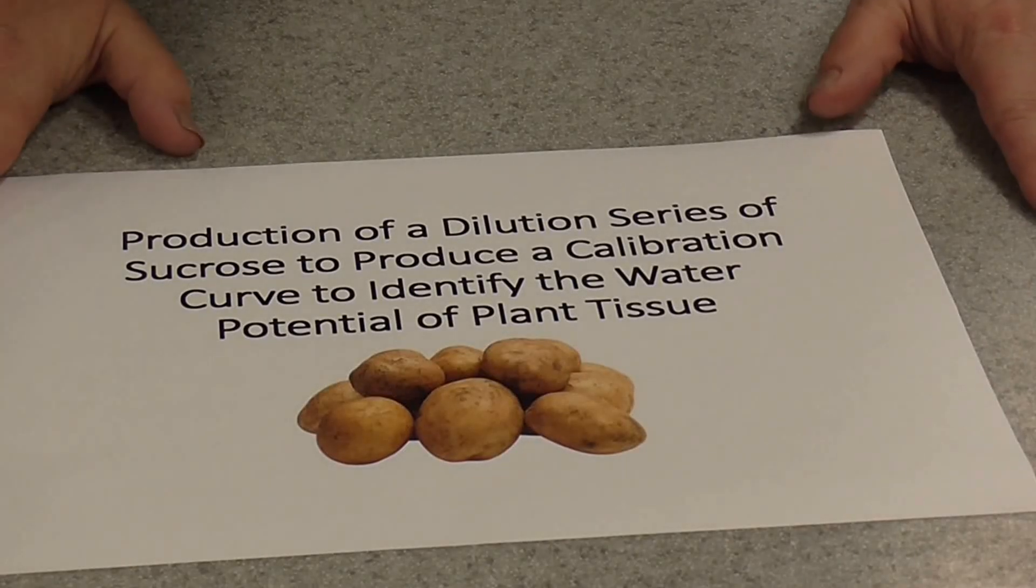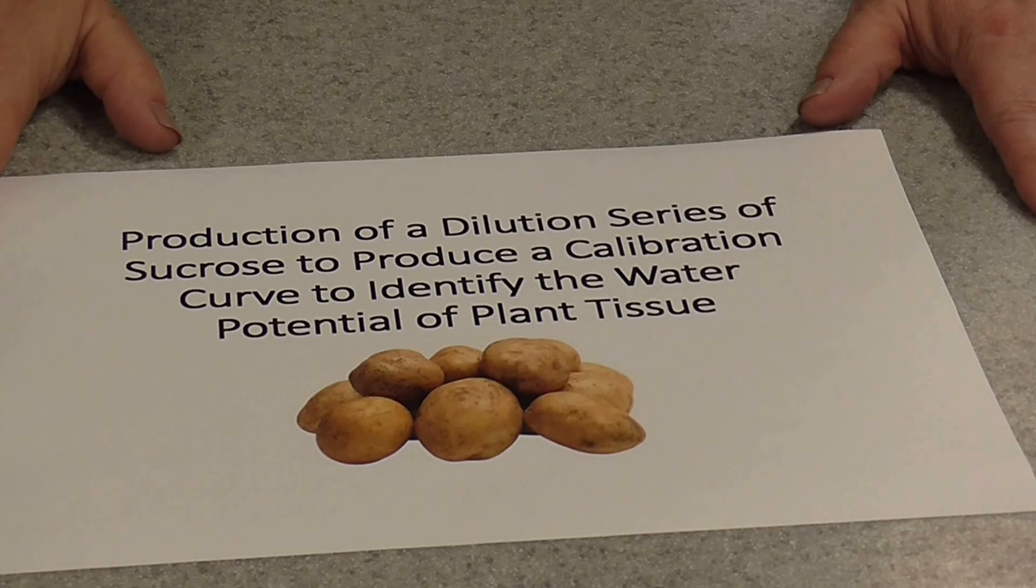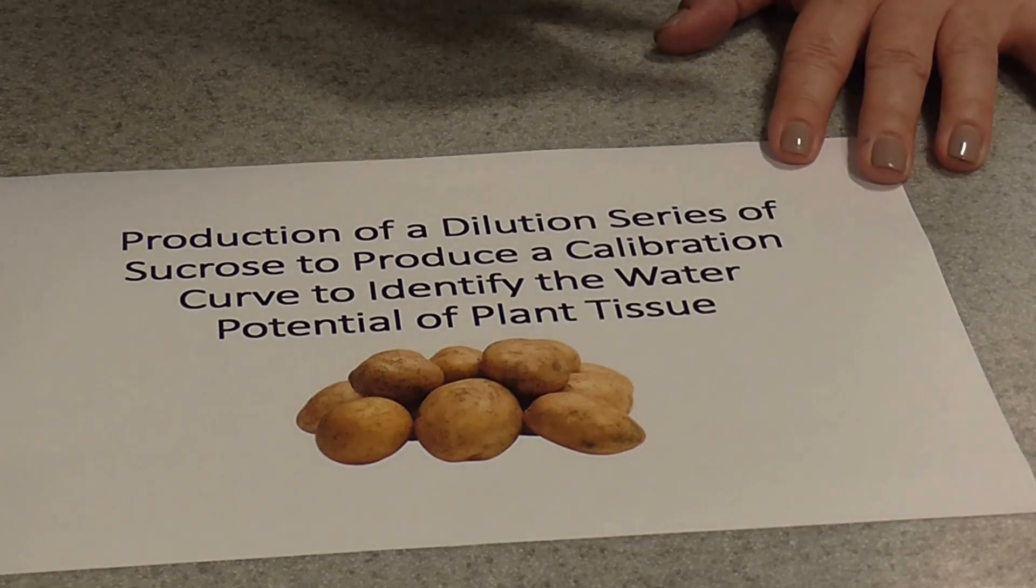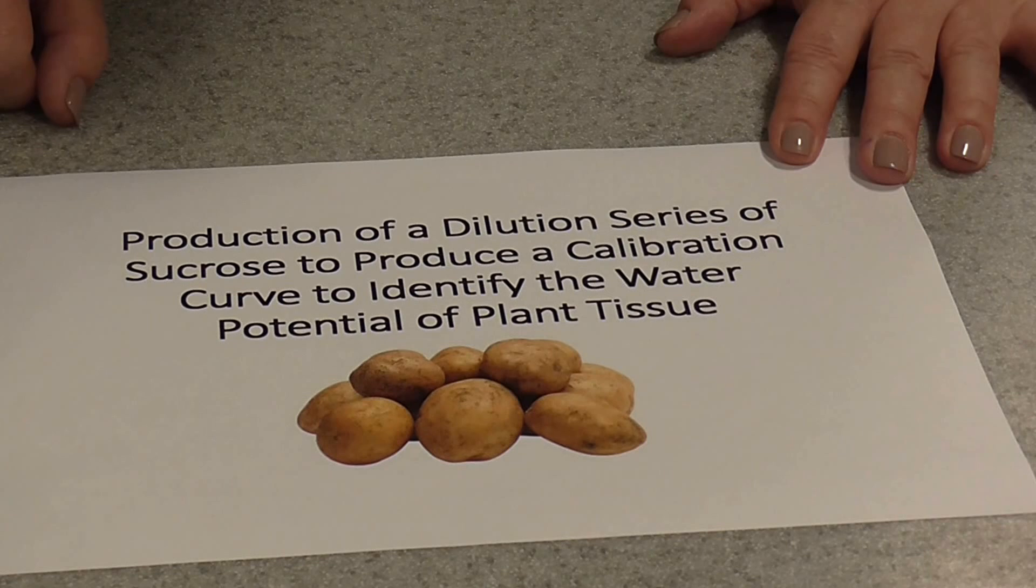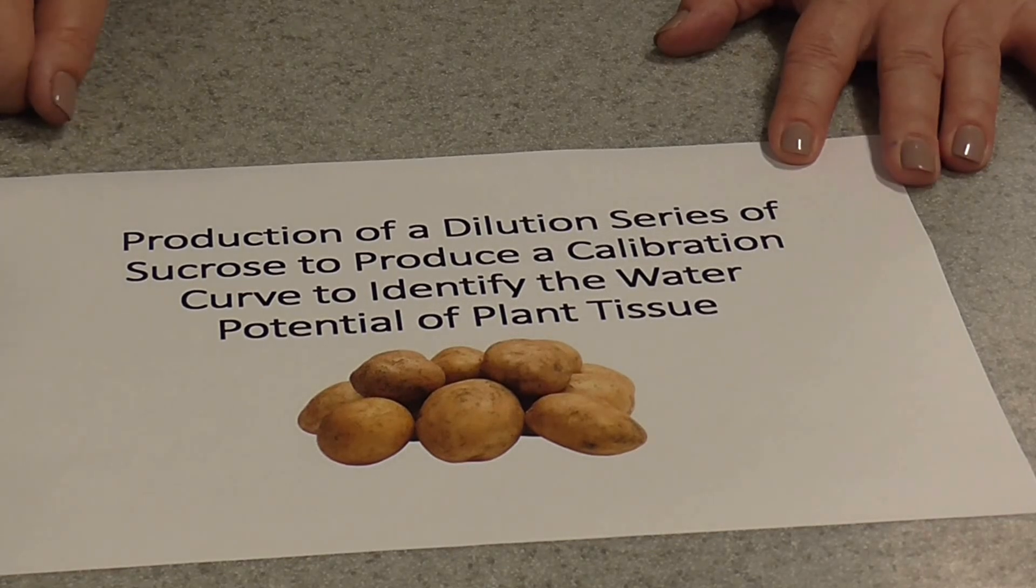Today I'm going to show you how to do one of the A-level biology required practices. You need this for the AS and the A-level biology and it's the production of a dilution series of sucrose to produce a calibration curve to identify the water potential of plant tissue.